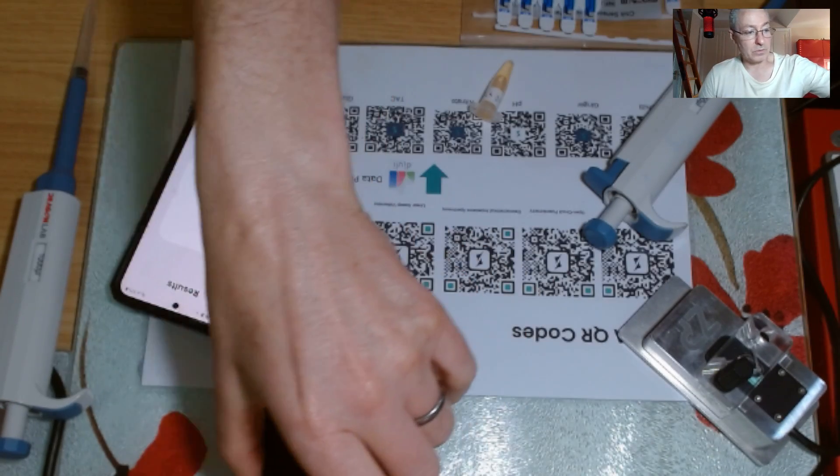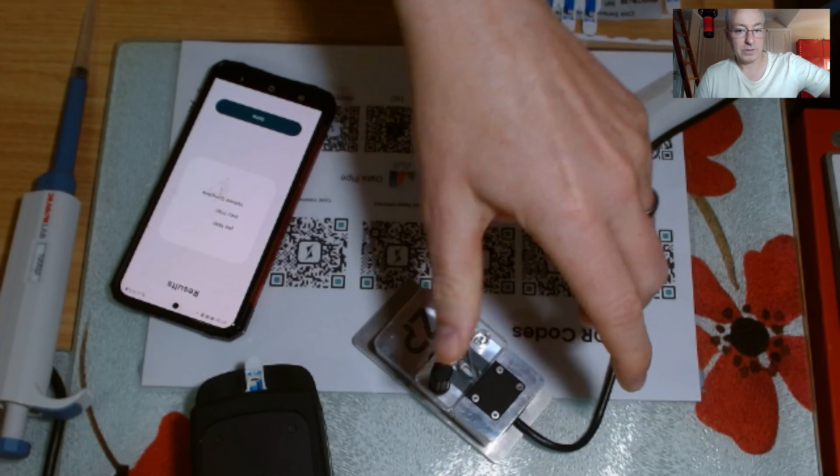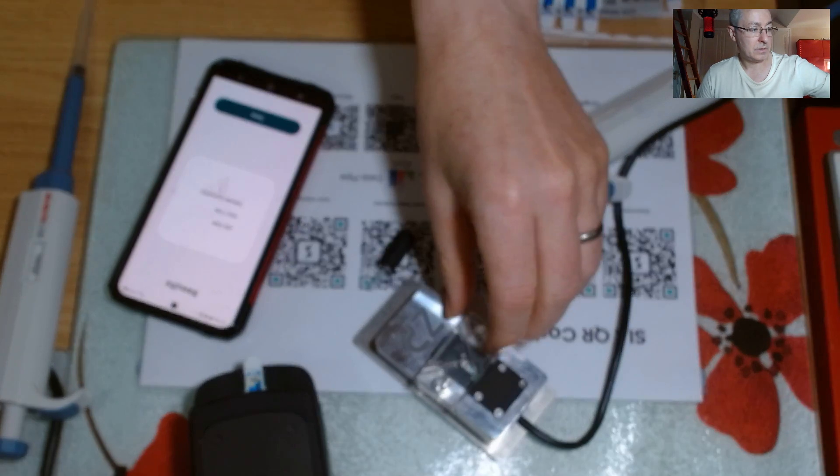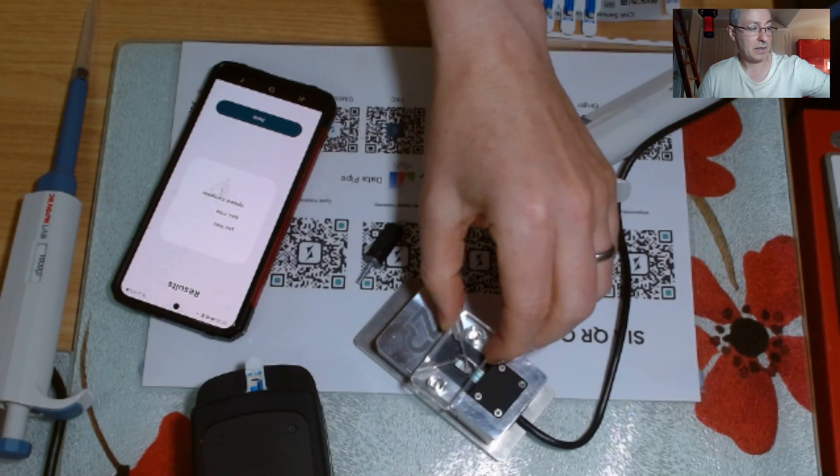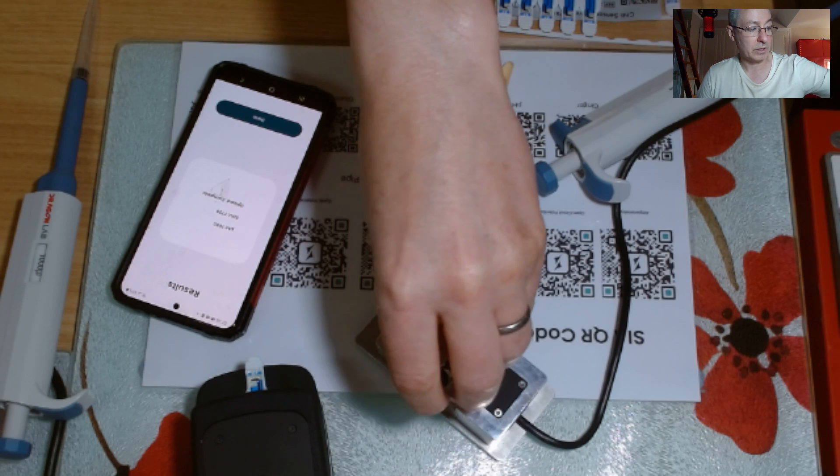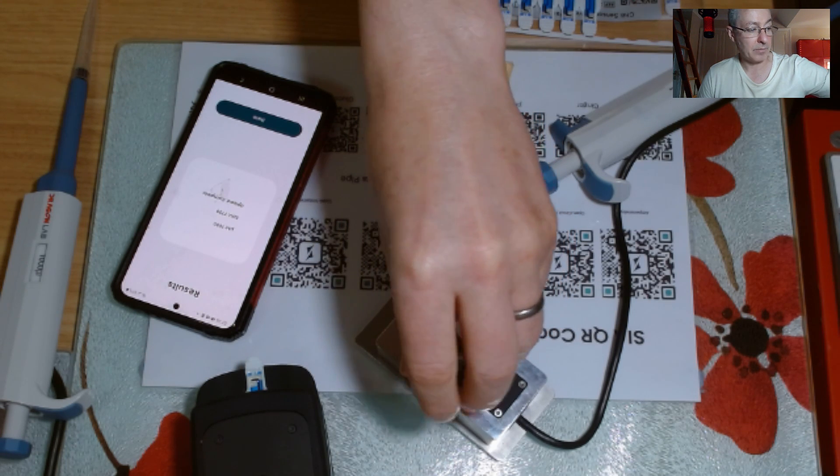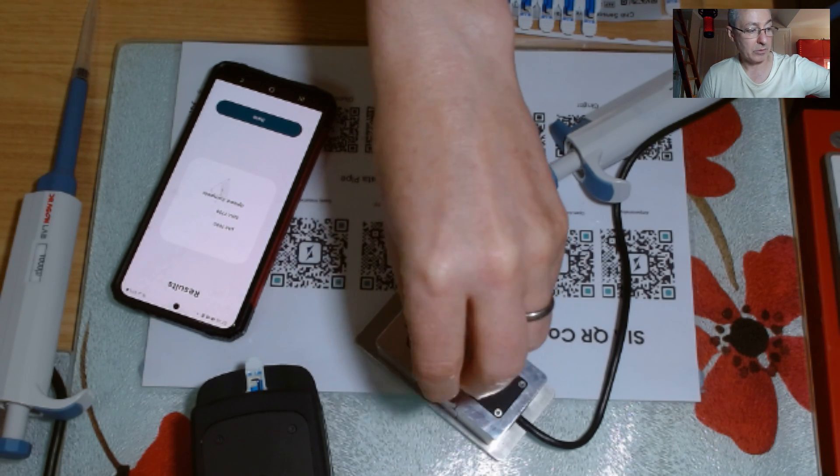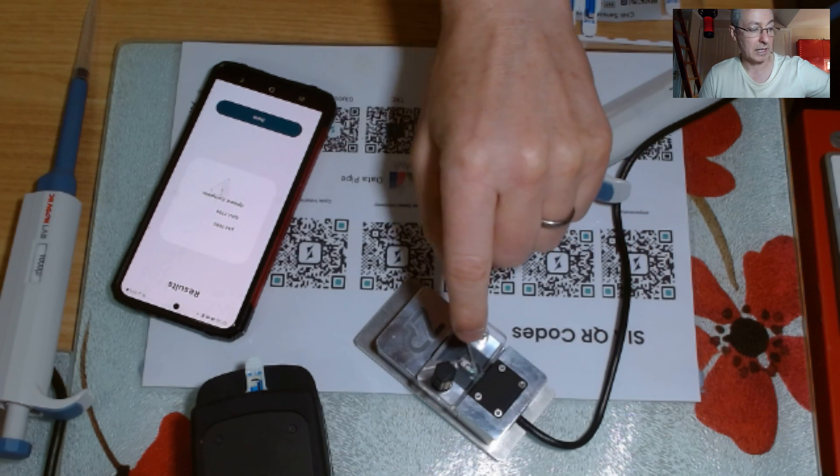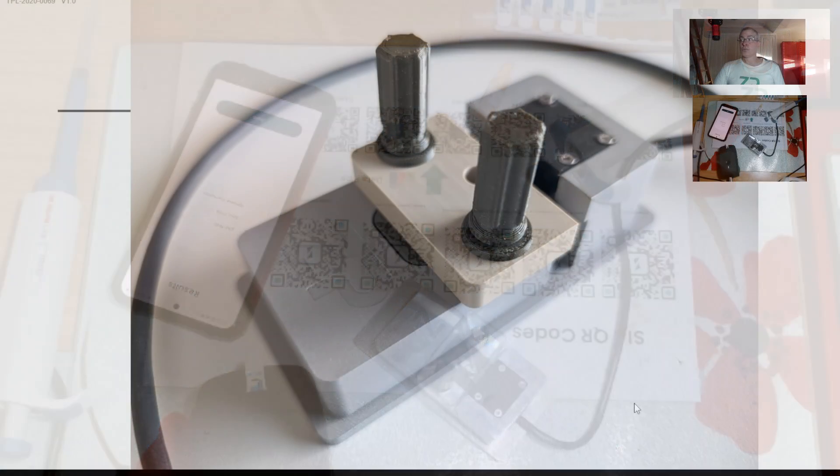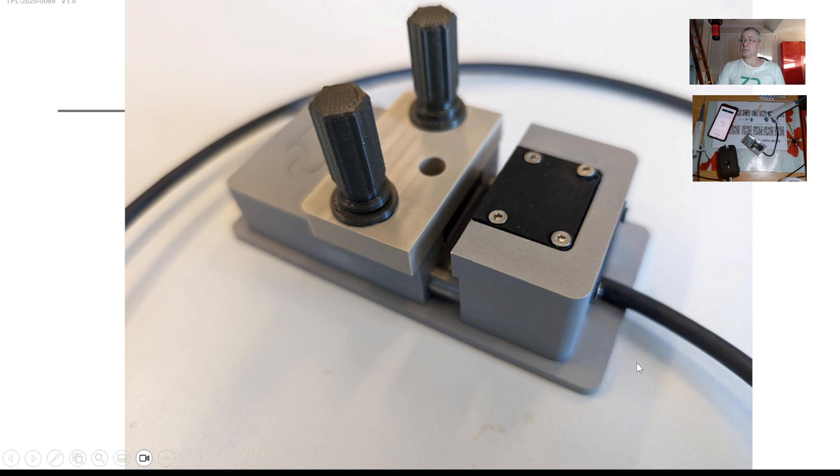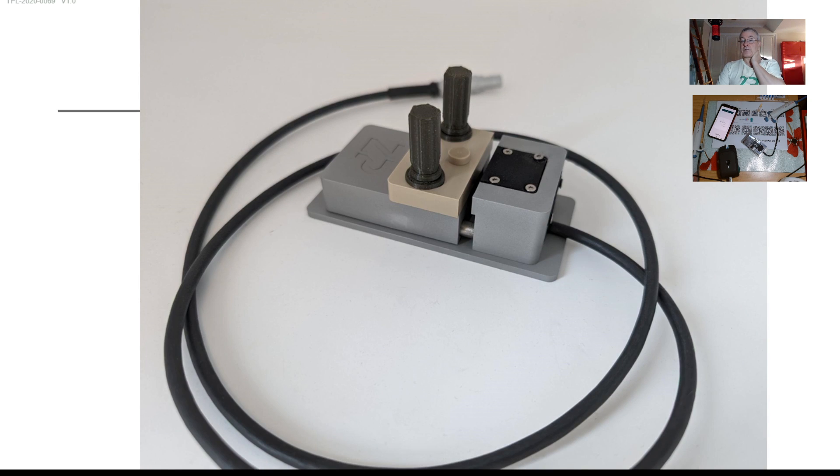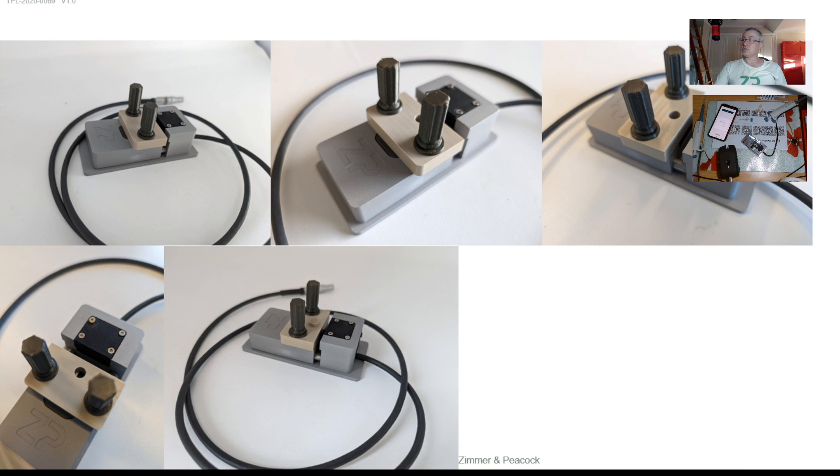In fact, I've got a similar device just in front of me here now. So the screen-printed electrode is actually there, and this one is actually a flow cell version. We can actually screw these connectors. I've got two of these, and they kind of go down like that, and then they'll hold a flow cell on top of the screen-printed electrode. The one I'm showing here is actually a batch system, where you've got a hole here, but the hole is essentially the volume on which the material is held within. So you can have very small, essentially, micro-reactions in this kind of setup.